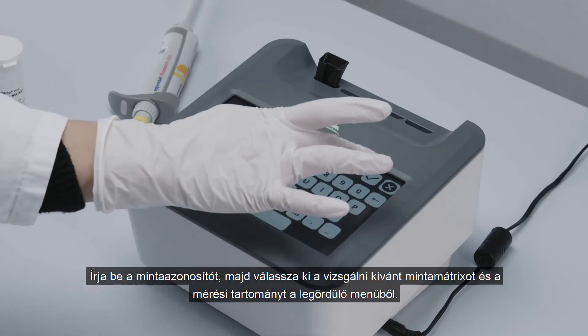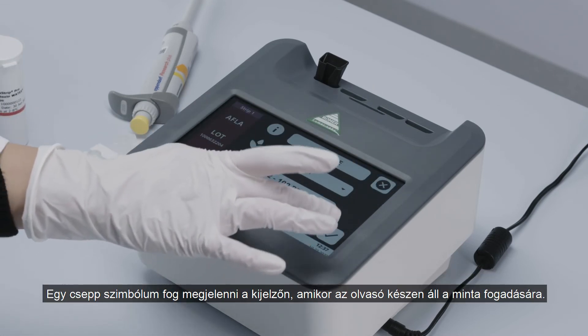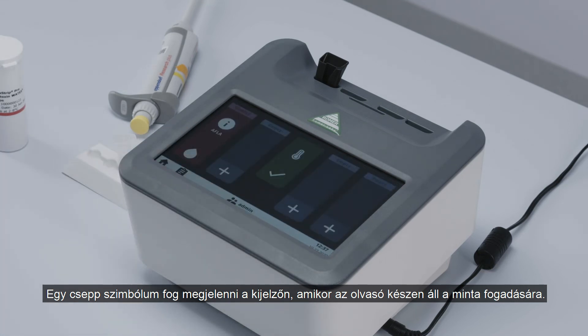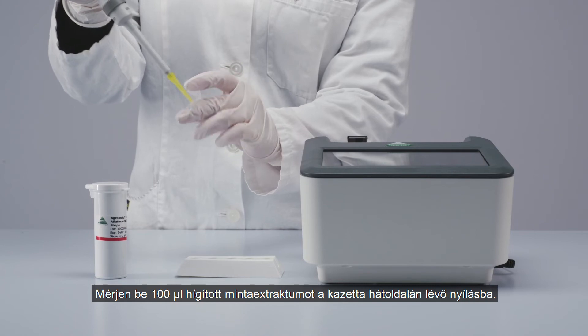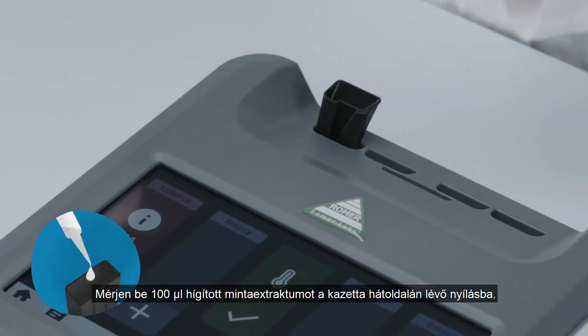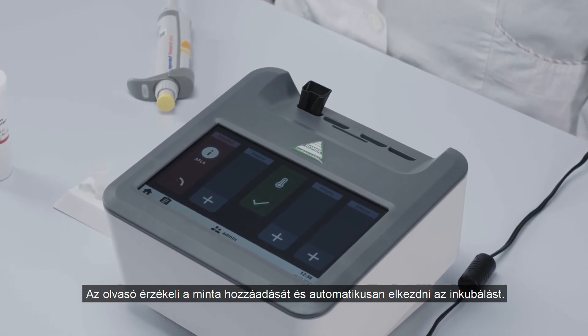Enter the sample ID and select the matrix and quantitation range via the drop-down menu. A drop icon will appear when the reader is ready for the sample. Pipette 100 microliters of the diluted sample extract into the opening on the back of the cartridge. The reader detects the addition of the sample and automatically begins incubation.